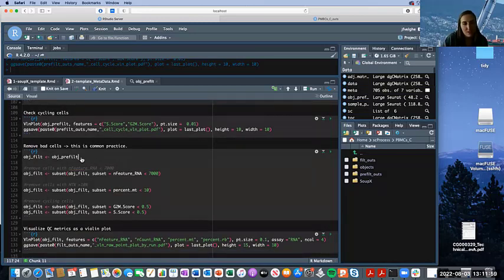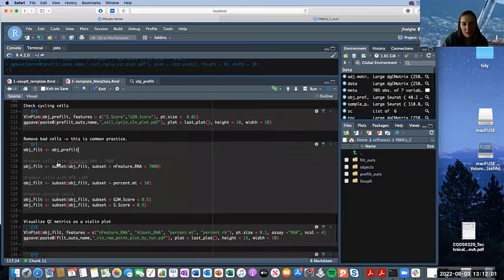So for this, I'm going to get ready to threshold. We're going to threshold down here. I'm just going to first rename this object. We're going from this pre-filtered object, and we're now going to call it filtered, because that's what I'm about to do. If I filter it, look at what it looks like, and I don't like it, I can always go back to my pre-filtered object. Plus, we already saved it initially as well. This is just a quick way to go back to that.